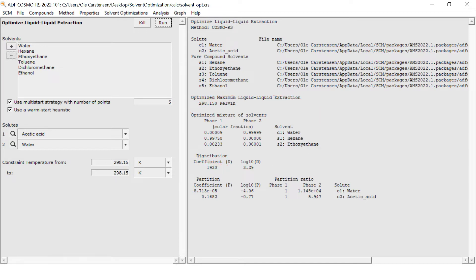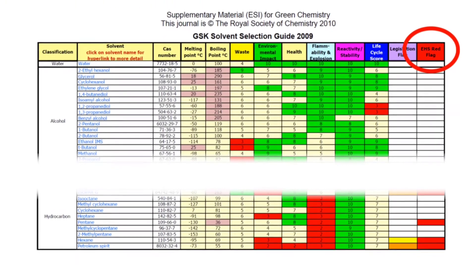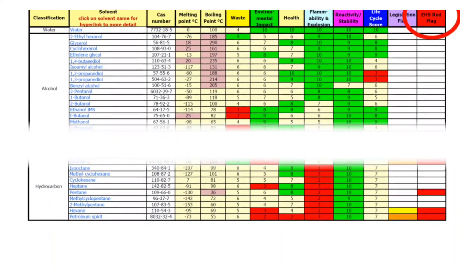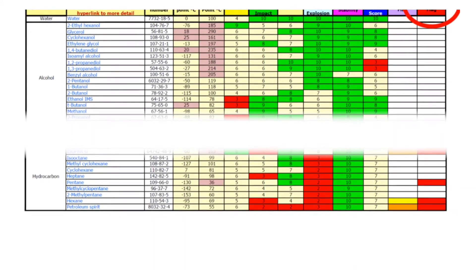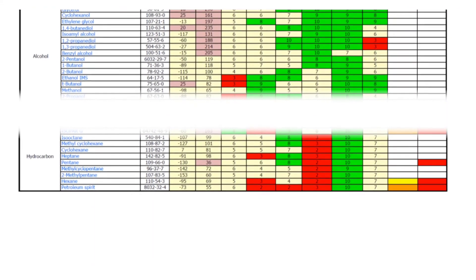Though effective at the task of separating water and acetic acid, N-hexane raises red flags when it comes to EHS compliance. As a peek into the GSK solvent selection guide will tell us right away, let's see if we can get around this.